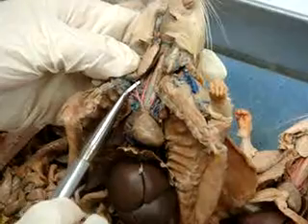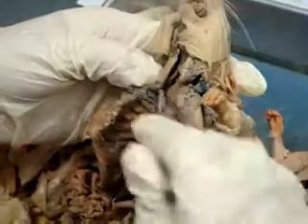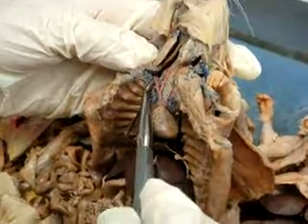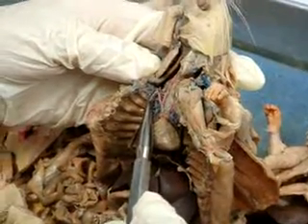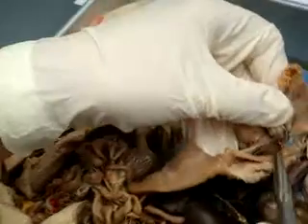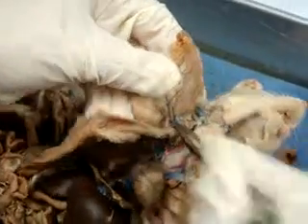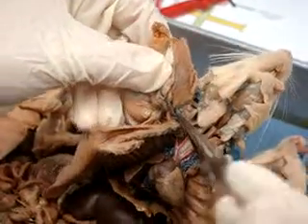that's your superficial cervical artery, okay? The one that's right beneath it, that's going into the body wall, right there, that is your axillary artery. That axillary artery goes into the body wall and comes out right there. Can you see that? Everybody see that?